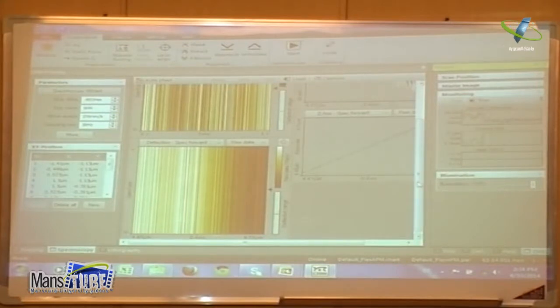Actually, with the AFM we also have the possibility, on the right side here, of monitoring. So we can really see what's happening with the deflection, what's happening with the piezo when it's moved up, what's happening with the motor, and you can monitor the signal here when you are making the measurement.